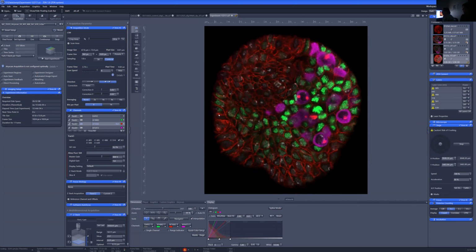I'm going to drive the microscope a little bit, and then I'm going to talk about the analysis that I'm doing and how AI definitely could help make the analysis stronger. Be right back.